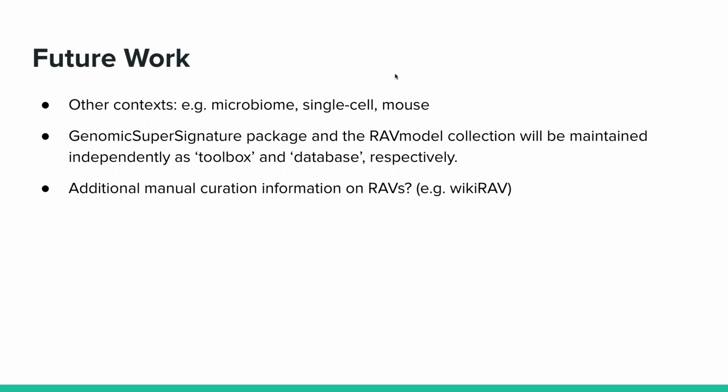I don't remember in the slides that you had, did you have, for example, the genes from the leading edge in that as well? Because if you did, there could be some kind of one step to put that into GenTonic. Speaking in a very biased way in here, but if you had this information, then you don't need to recompute anything, and you can just say, oh, it's just like my DE genes, or the relevant genes. And if you do have those, then there's a whole new world out there to explore interactively as well. I'm not sure if we get leading edge genes from a pre-ranked GSEA.